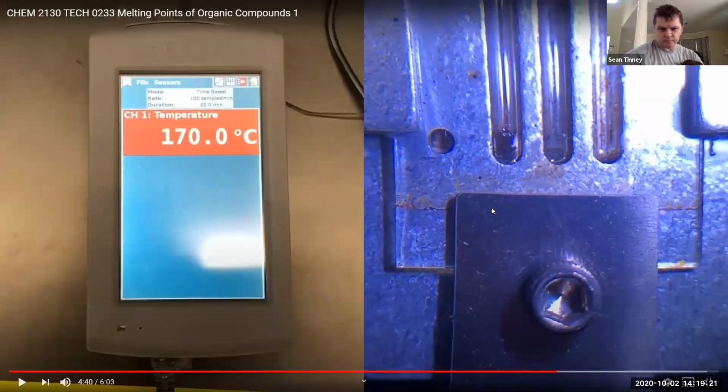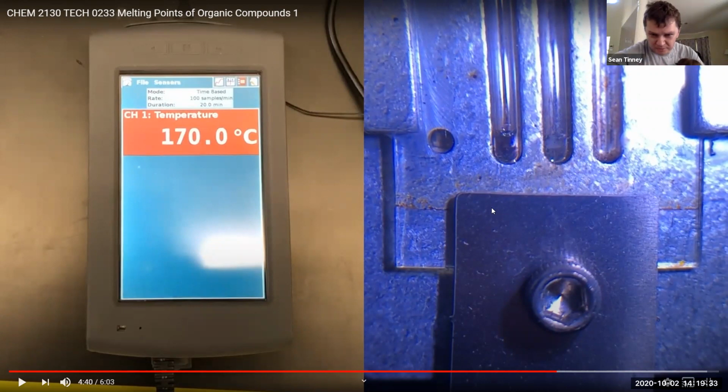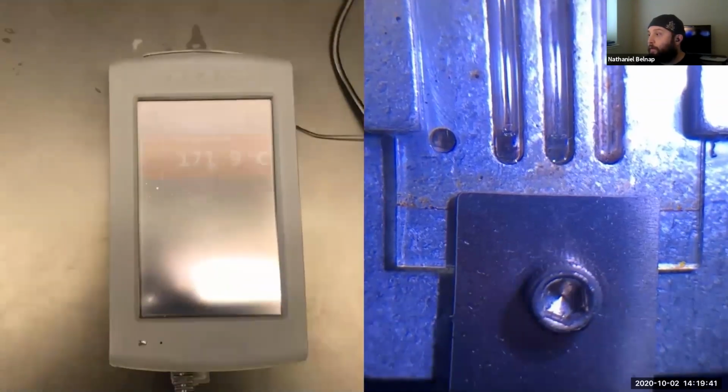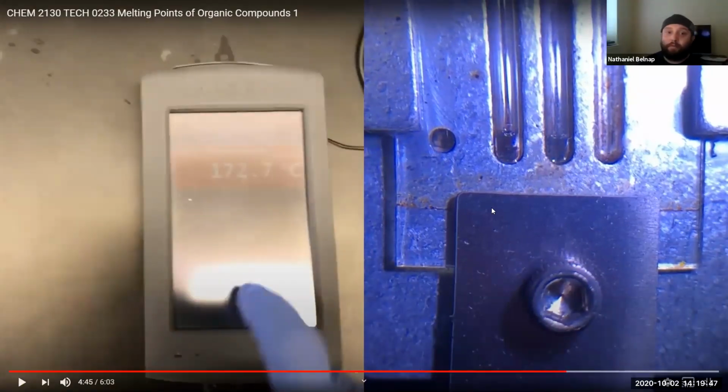Now. Is it completely melted, you think? I know it's kind of hard to see. Does anyone else think it's not completely melted? A little bit of white in there still. Yeah, kind of on the top left. Okay, so let's keep going a little bit longer. Now. Perfect. 172.7.